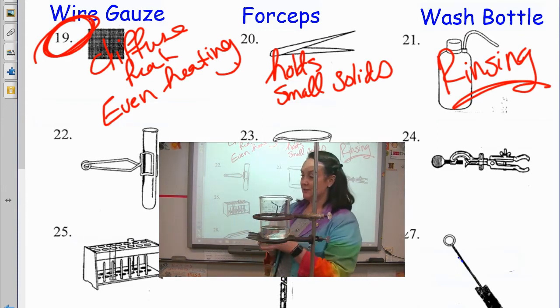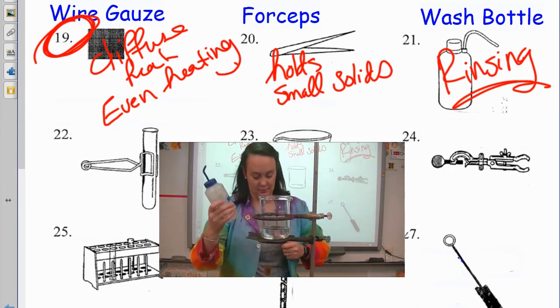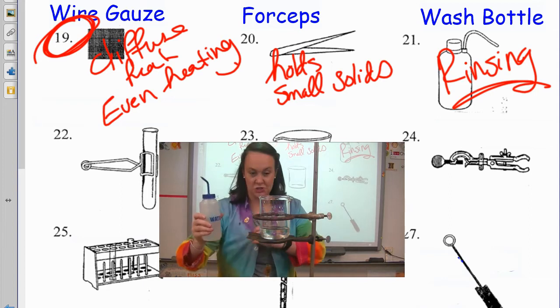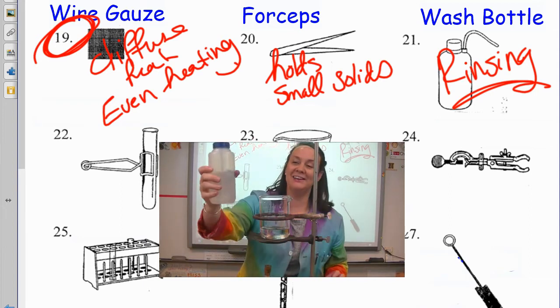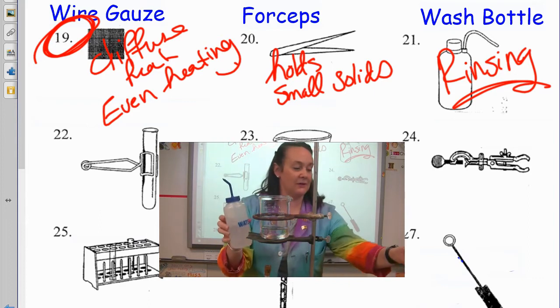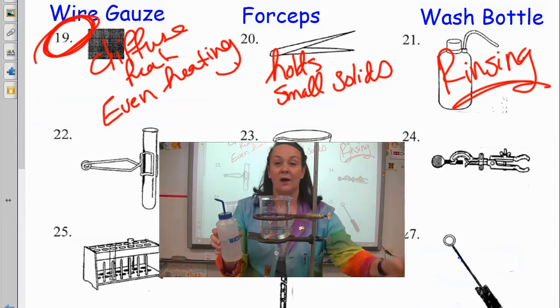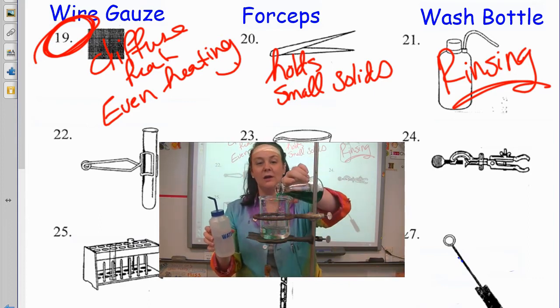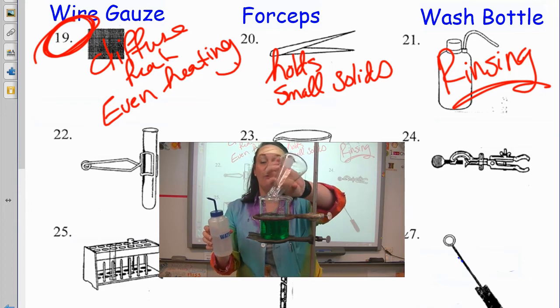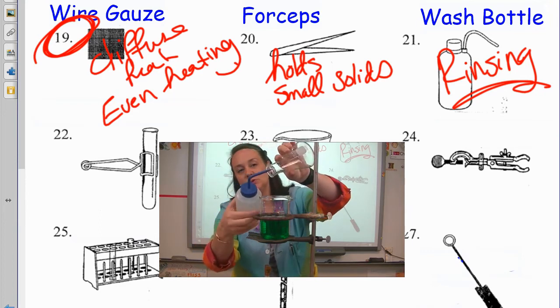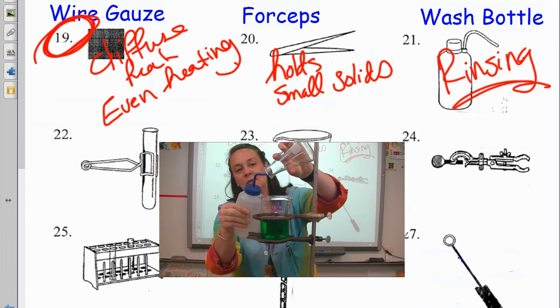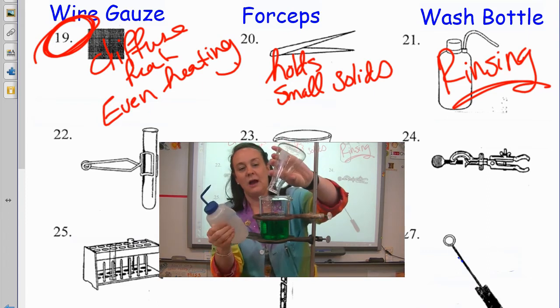People are like, woo, it's a chemistry squirt gun. Like, it's not when you're like, ah, no, it's not a hydration factor here. What it is is if you needed to rinse something out, let's say we formed a precipitate in this Erlenmeyer and we're trying to get it all into a funnel or something like that. What you do is you can just use this and rinse the inside of your glassware out.